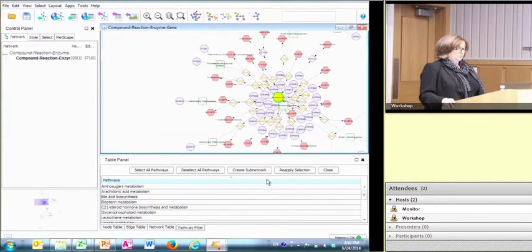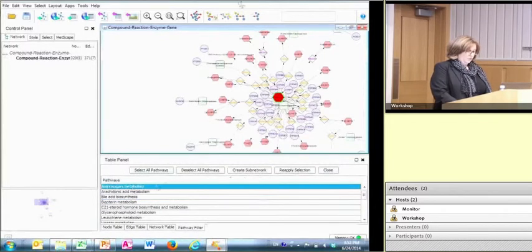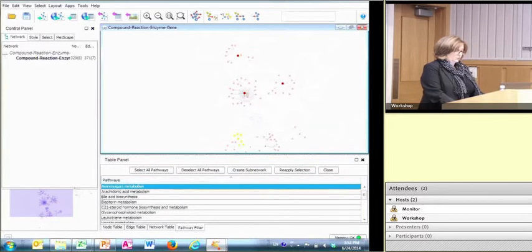And so we decided that it's okay to have a huge hairball, basically, because what we're going to do instead is build in a number of different filters, okay? And so one of these filters is right here. We call it a pathway filter.